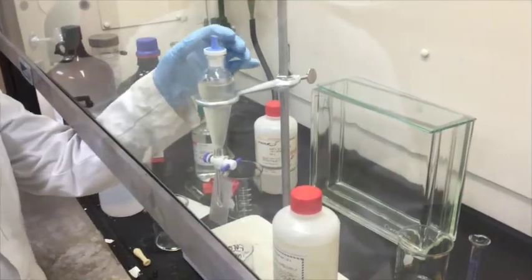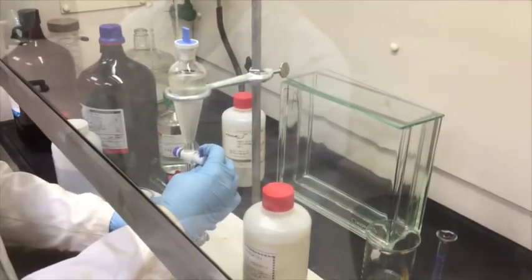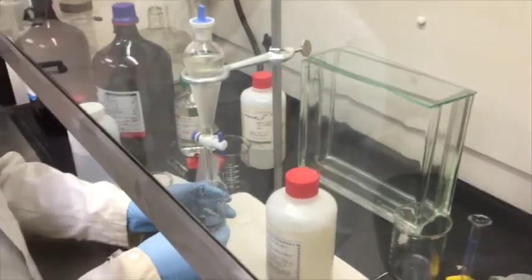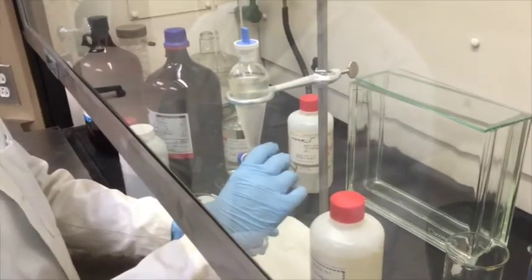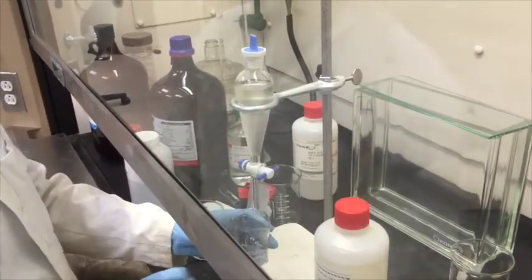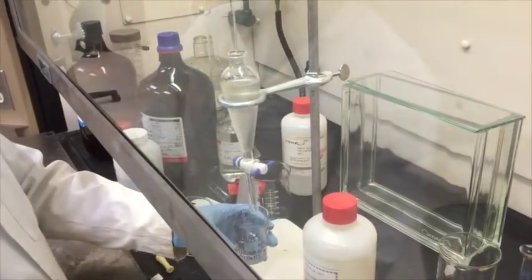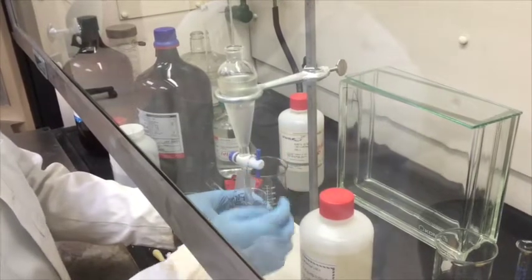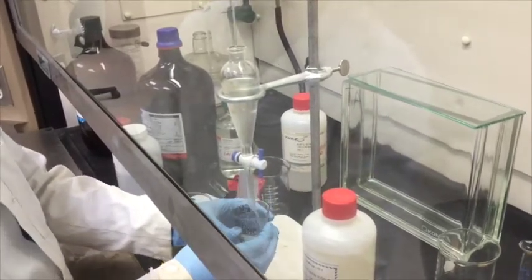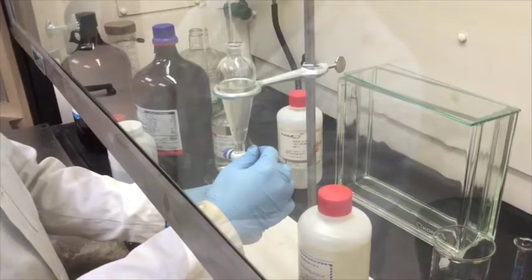Another simple tip that might seem a little bit silly, but is pretty useful to remember: we see here Becky's having trouble draining the separatory funnel. She's just getting drip, drip, drip, and if this is happening to you and you're getting frustrated, it happens to the best of us. But Becky hasn't actually forgotten, she's demonstrating for us. If you forget to take the top off, then it's not going to drain nicely. So again, make sure that you pull the top off when you're draining a sep funnel so that it drains nicely.